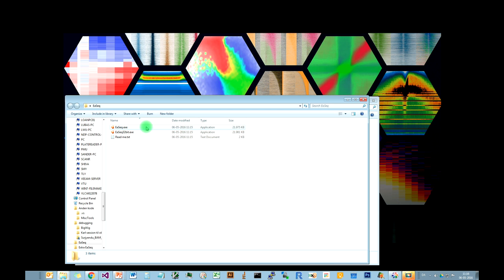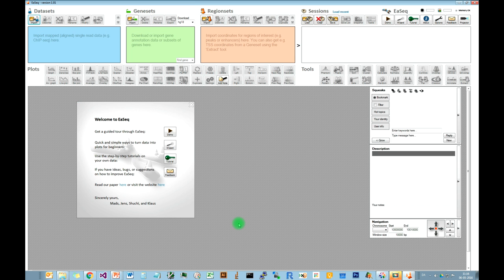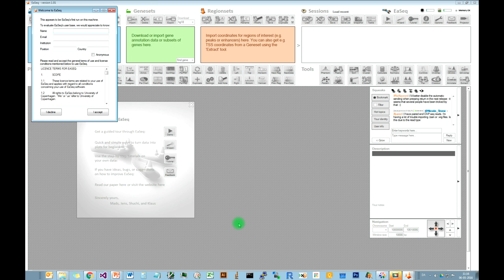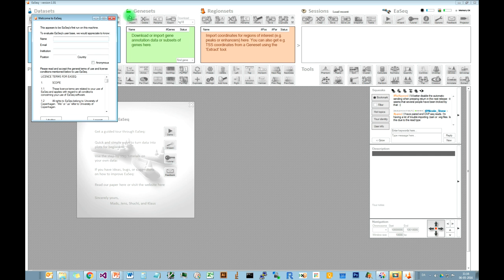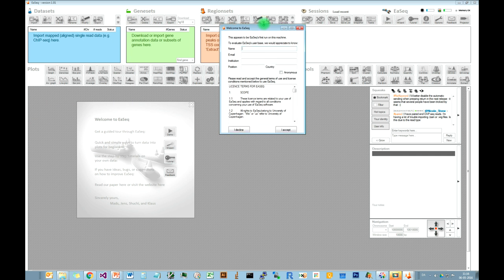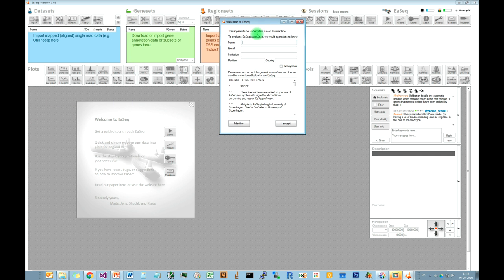You can just start EASEQ — there is no further installation required. You just double-click on EASEQ, and then the first time it will ask if you really want to run EASEQ. Then EASEQ will start up. The first time while you are in EASEQ, you are encouraged to write your name and affiliations so we have a little more information about who is using EASEQ.